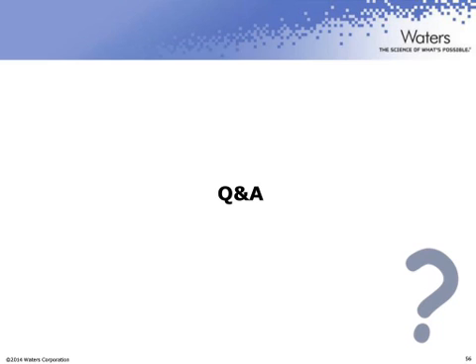And a number of questions have come in, so let me get to that. Some of these questions touch on issues that you have already answered, but given the number of questions that have come in related to that topic, it may be worth reiterating or clarifying some of the issues. I think most of the questions go back to the concept of trial runs, or unofficial tests that people perform. So when it comes to trial runs, how should they be recorded? How should they be labeled? And where should they be stored?